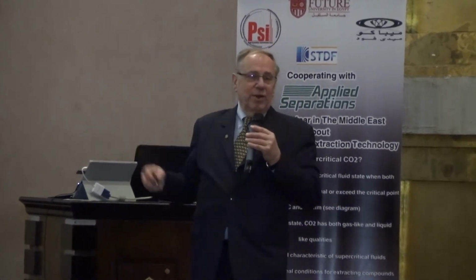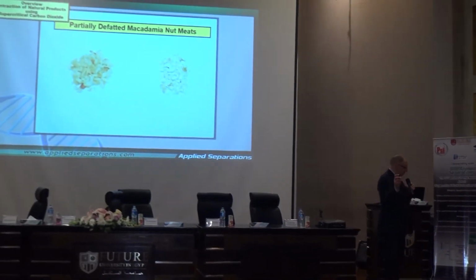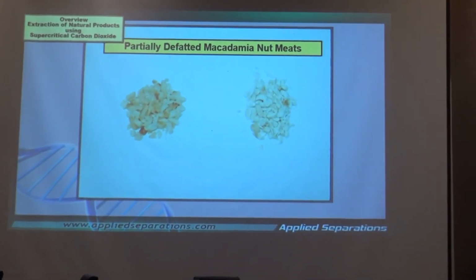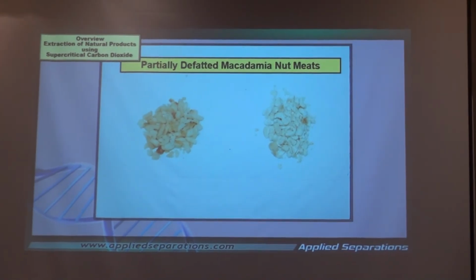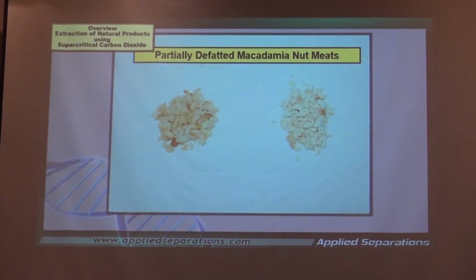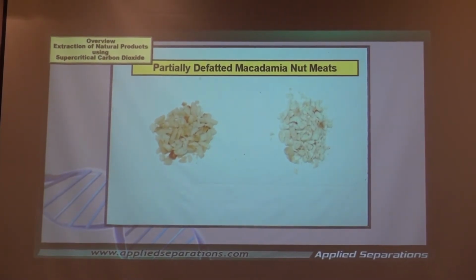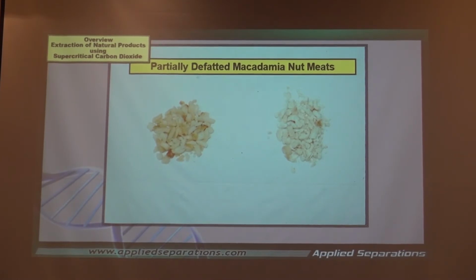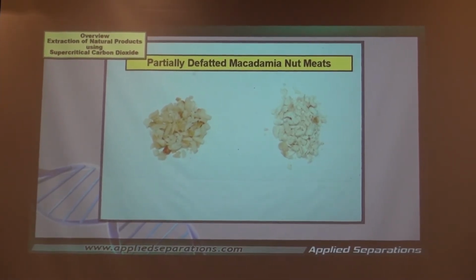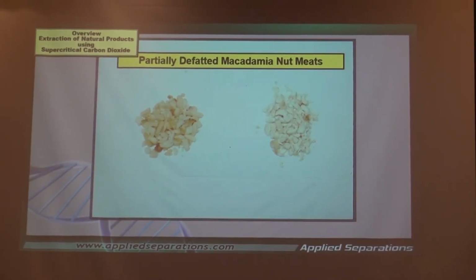A couple of other areas. This is one I wanted to talk to you about from the first hour, fat reduction, and solvent-free products. This is macadamia nuts, and this is really quite interesting. You may be familiar, but any tree nuts work the same way, to a greater or lesser degree. What's happening here is the company does a partial extraction of the oil in the nut. Now this is very clever. You take only some of the oil out.